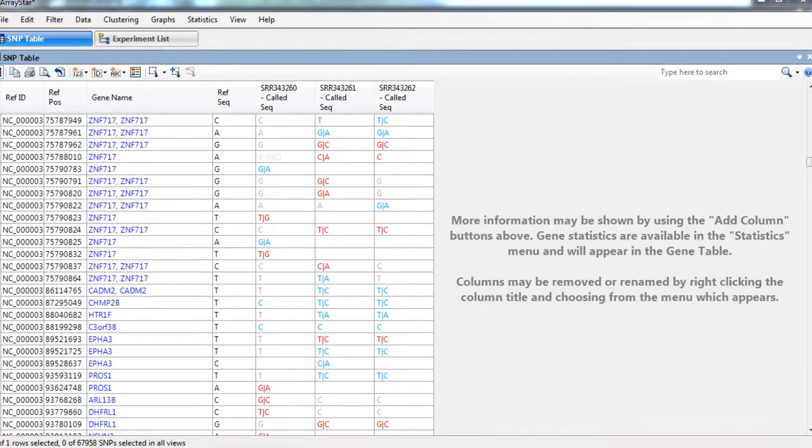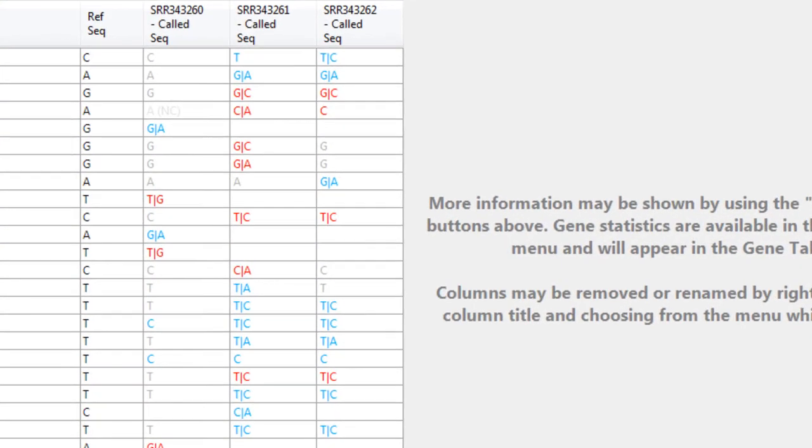Sometimes when looking at the SNP table in ArrayStar, we can see blank cells. We can't make assumptions on whether we do or do not have SNPs at these positions if there are blank cells, so we want to add novel SNPs, not in the dbSNP database, to our genome template package.